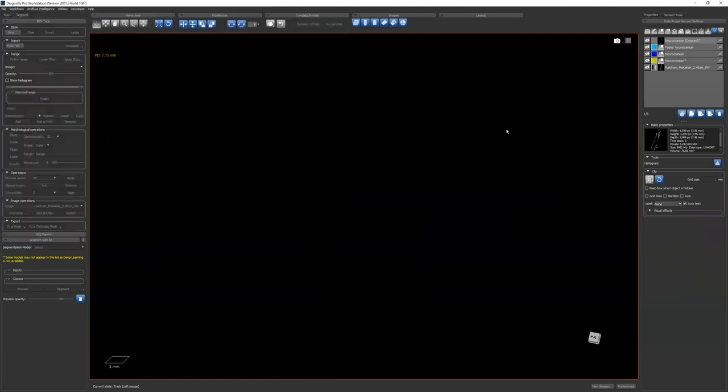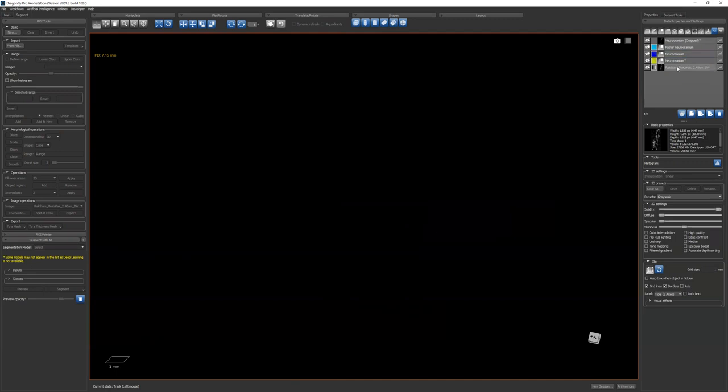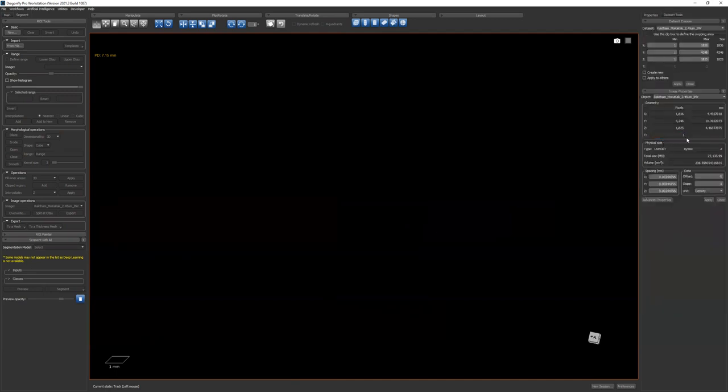I didn't talk about this at all, but I will talk about it with the importing data. If you go to your original volume, and then image properties, you can find, here, the spacing, which is very important. This tells you the voxel size.